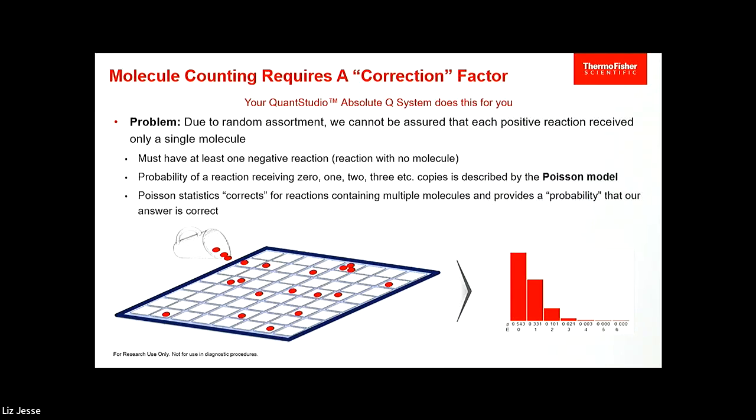Let's envision that I have a grid that has a certain number of squares. I'm then going to take a bucket of balls that has the exact same number of balls as there are squares. If I were to take that bucket of balls and drop it over the grid, technically, I would love it if there was one ball that fell into each grid, but the random distribution of nature doesn't work that way.